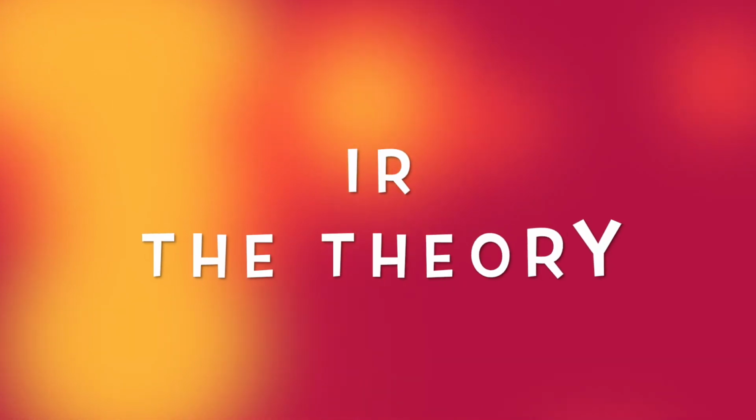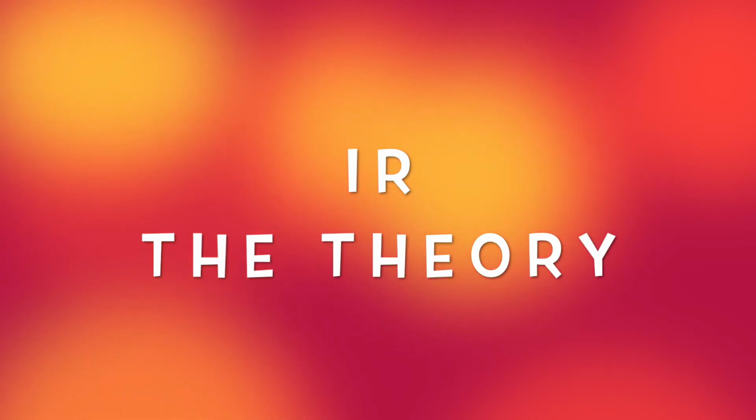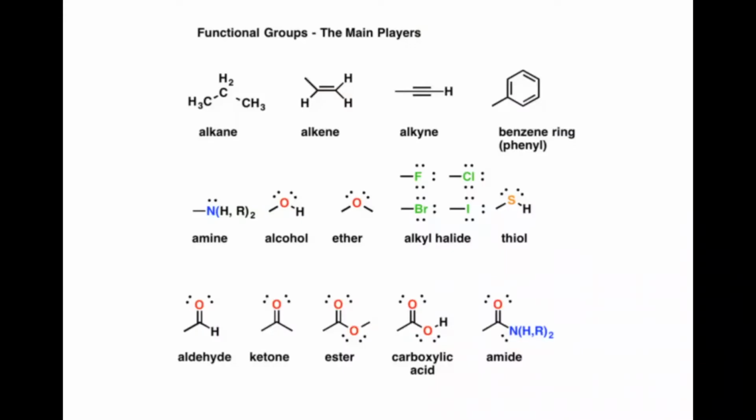So infrared spectroscopy is one of the main techniques that we use to identify what our product looks like, so we can verify that we made what we thought we were going to make in the lab. Functional groups are the main piece of information that infrared gives us. Looking at the infrared spectra of a compound, we can determine the kind of functional groups that are in a molecule. For example, alkane IR spectra look very, very different from, say, a carboxylic acid spectra.